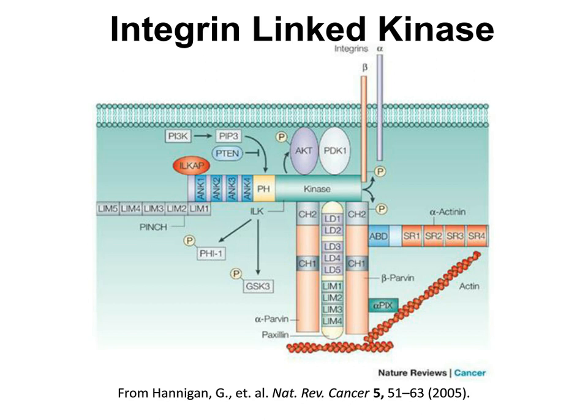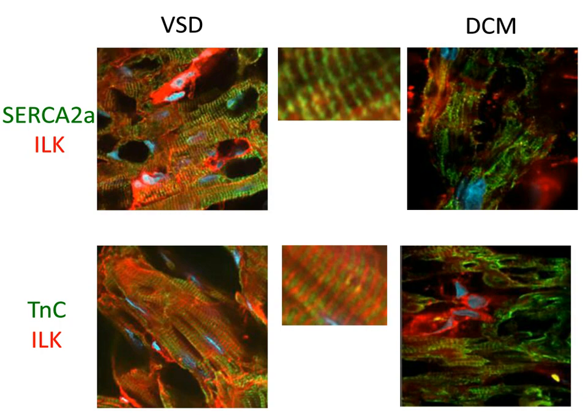And so what we wanted to do at first was show whether integrin-linked kinase was dysregulated in certain, particularly pediatric, cardiac diseases, using it as sort of a scaffolding or a nodal protein of cardiac survival signaling. And so I'll show you here some of the mechanisms by which we show that integrin-linked kinase was dysregulated in human disease.